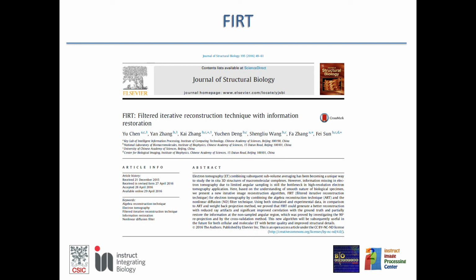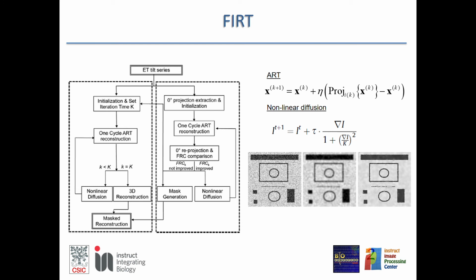And there is another idea, which is to interleave 3D reconstruction steps with projector steps that project your volume into a set of volumes that have some nice properties you are looking for, for instance, that they are smooth. So you alternate 3D reconstruction steps with denoising steps.